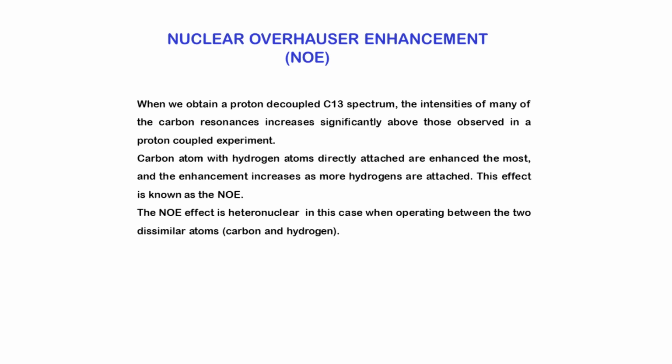The nuclear Overhauser enhancement is a key NMR phenomenon that arises from dipolar interactions between neighboring nuclei. It provides distance-dependent information that is invaluable for determining molecular structure, stereochemistry, and spatial relationships in both small and large molecules. NOE is especially powerful in biomolecular NMR for studying the conformations and interactions of complex biomolecules. Nuclear Overhauser enhancement, NOE, significantly increases the intensities of carbon resonances, especially for carbons directly attached to hydrogens.